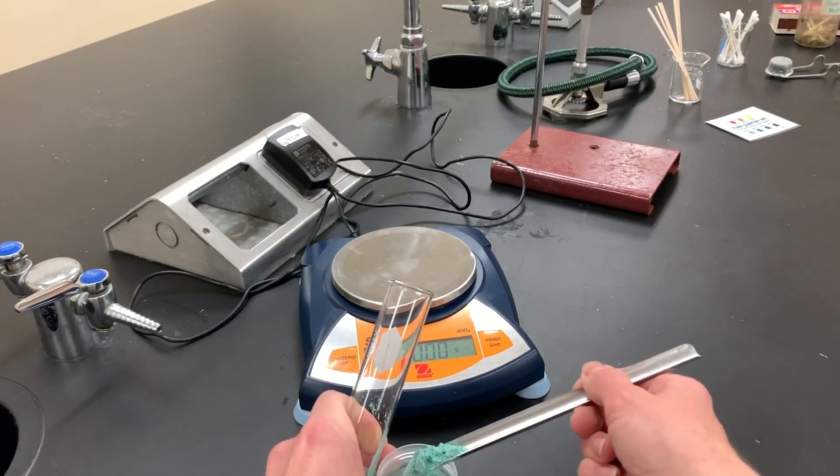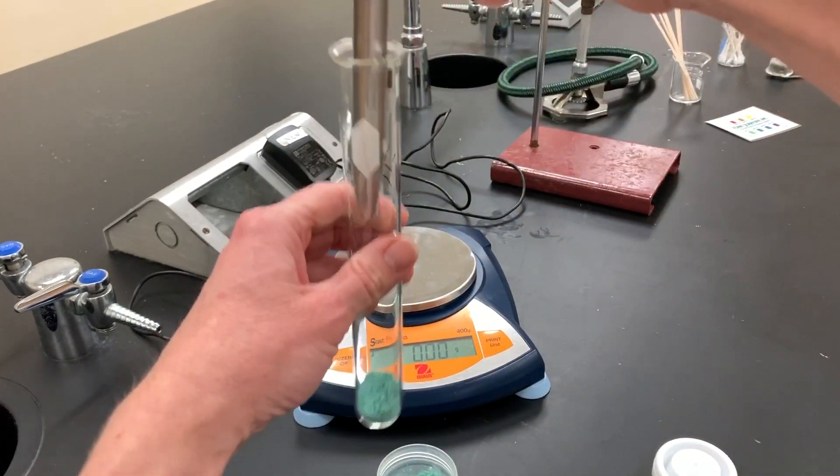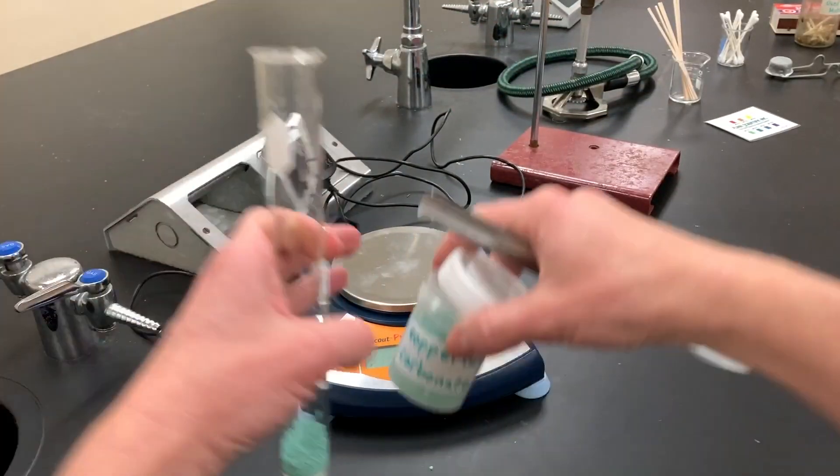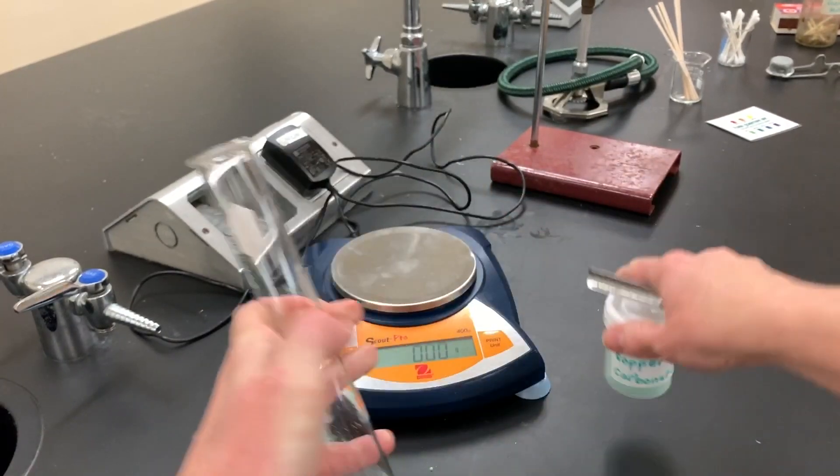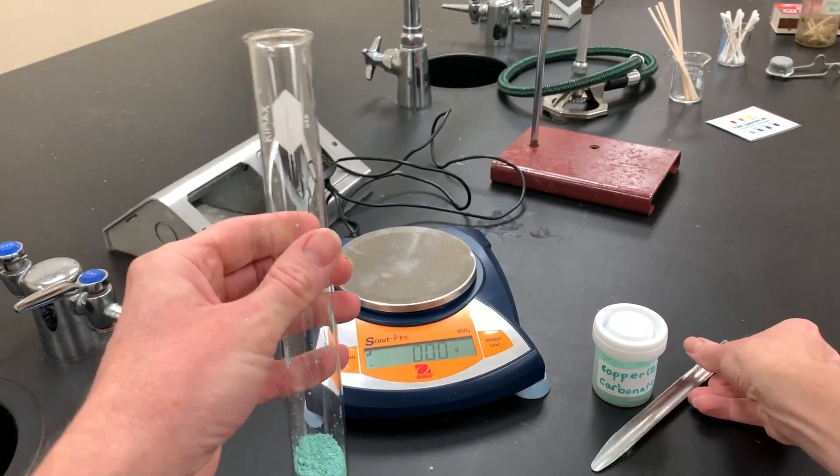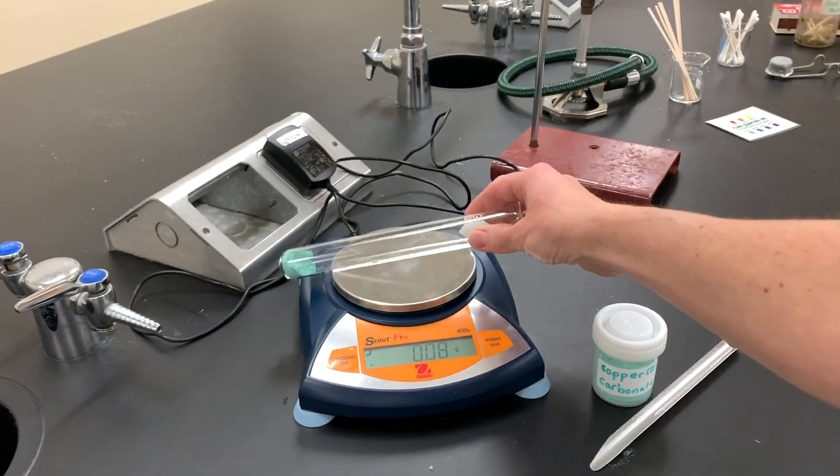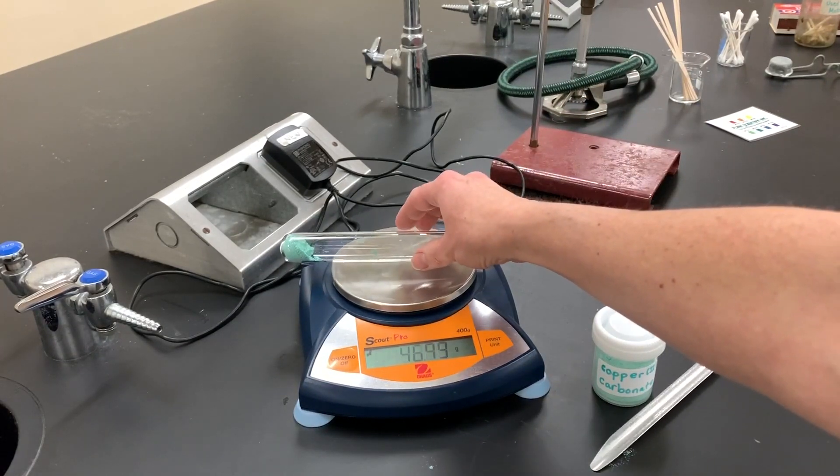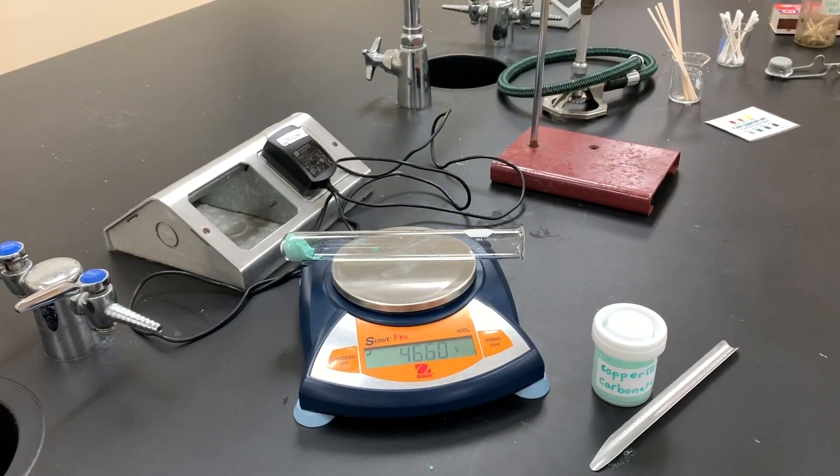As long as we have the original mass and we don't have too much in there to heat, we'll be fine. That looks pretty good for the experiment. Carefully place this on the balance again. Use the same exact electronic balance, get it steady, and record that mass: 46.60 grams in your data table.